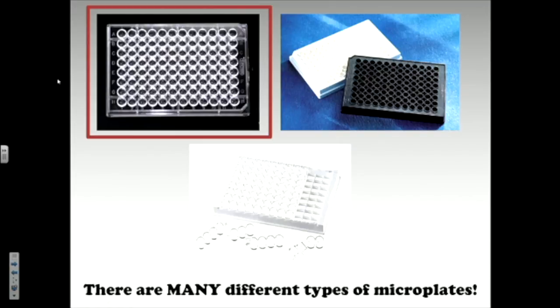So most of the time, for just a spectrophotometer-based assay, where you're generating color and shining light through it in your plate reader, you're going to use something just like this, a clear plastic one, but not a flimsy, crappy clear plastic one. And the wells have flat bottoms. Opaque wouldn't work because you're trying to shine light through something. It has to be clear, but usually something like this will work pretty well. There are ones you can grow cells in the bottom of. Crazy varieties.